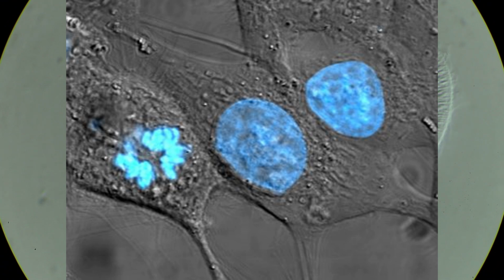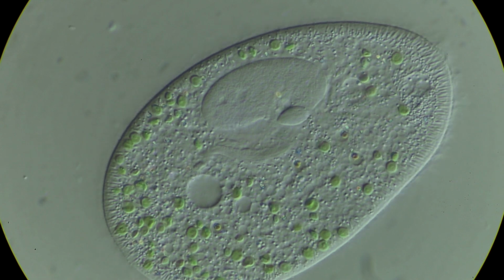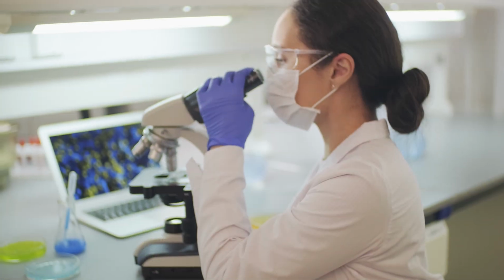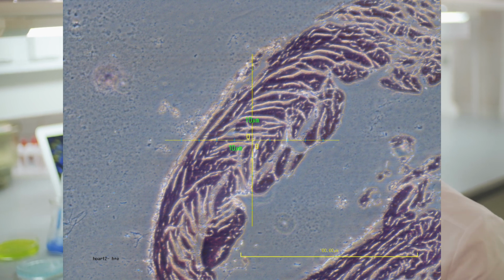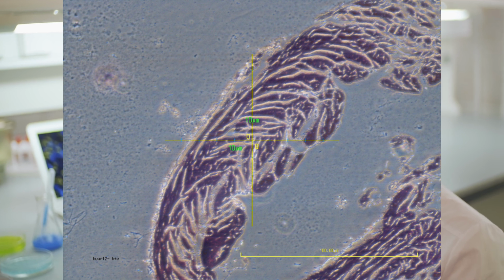Now, unlike most products that are used to stain clothes or similar fabric, you don't want it to stain absolutely everything. Typically speaking, you have a certain compound that allows it to be more permeable to certain parts of the cell or similar thing of interest to you. This means that it only builds up in certain areas.